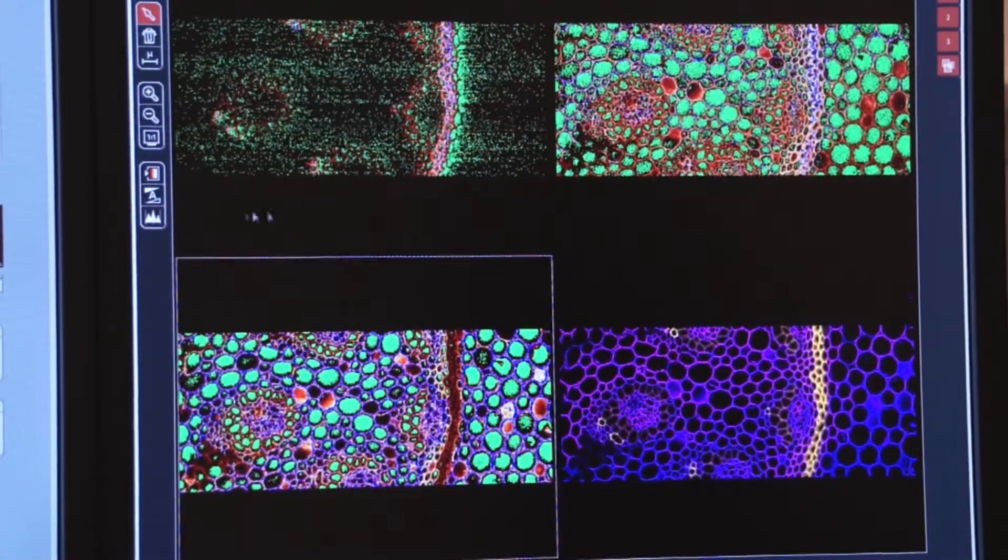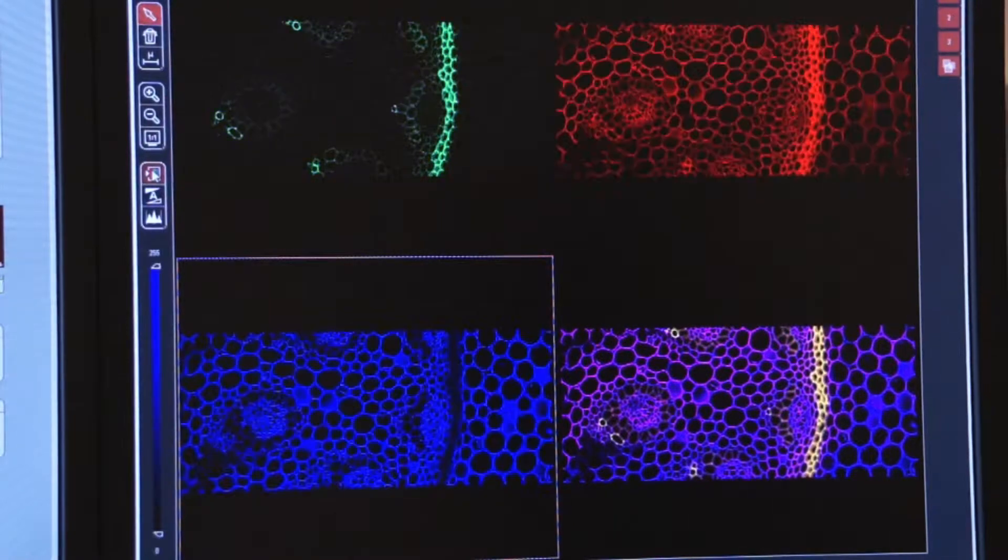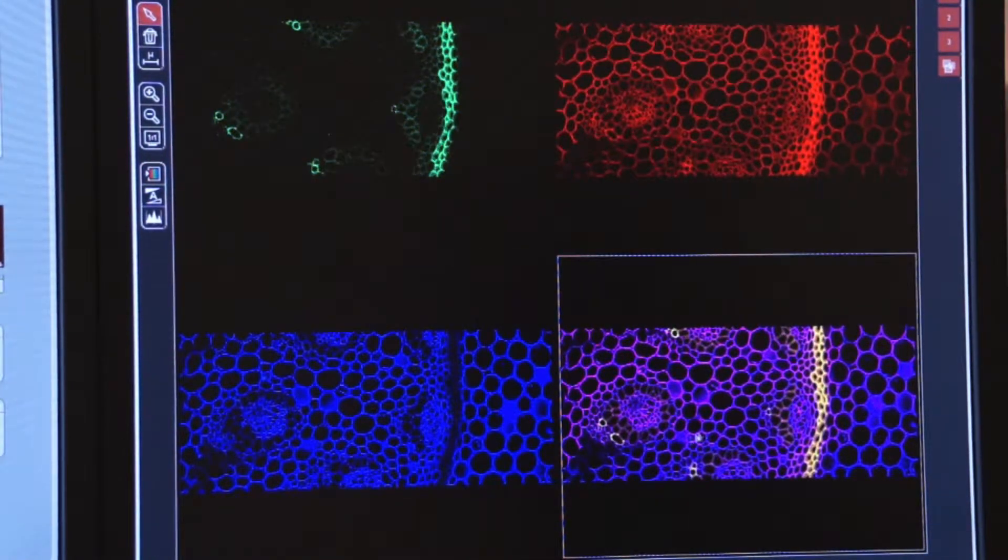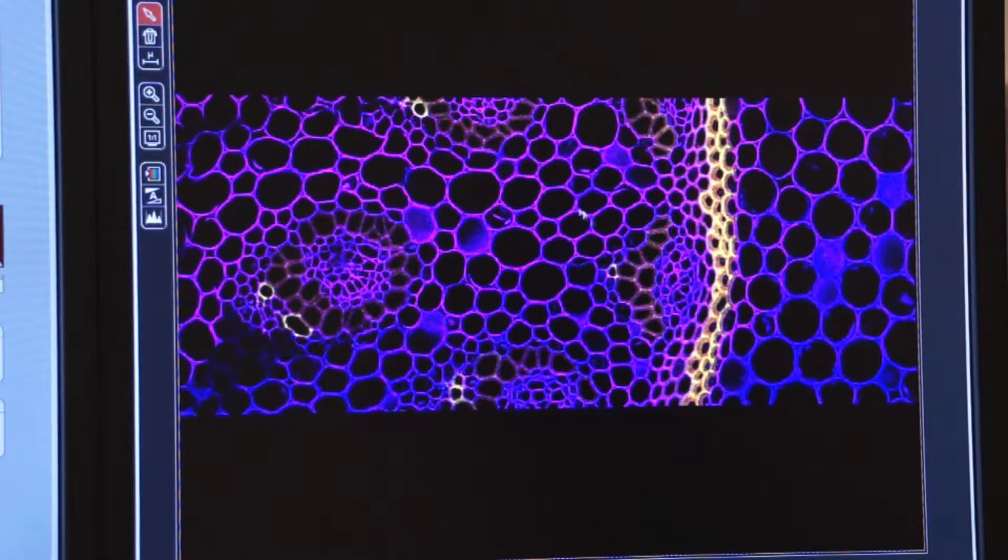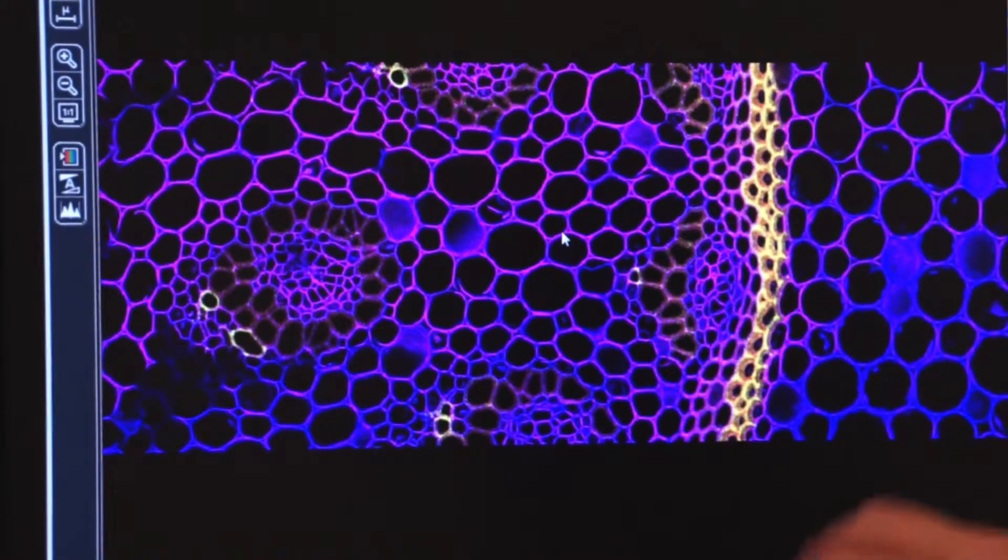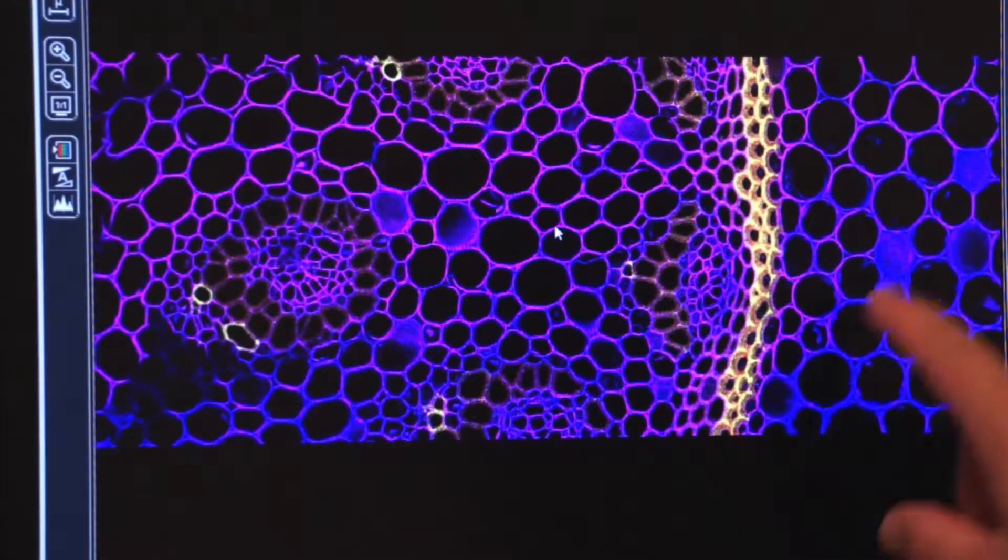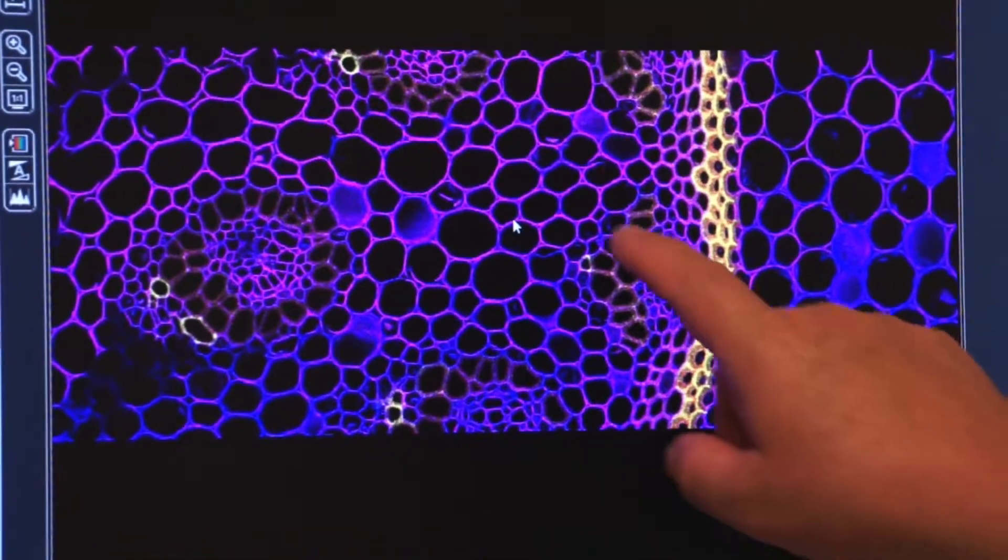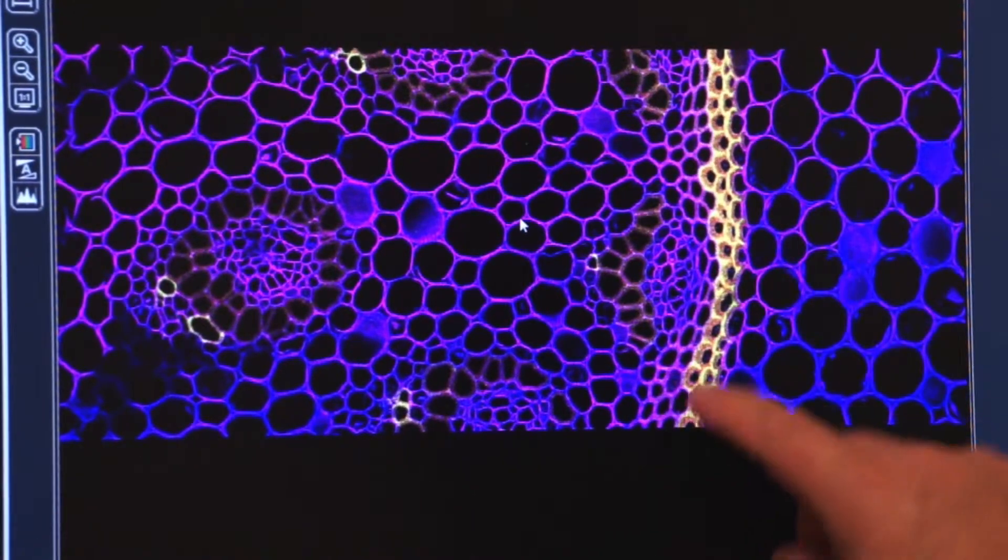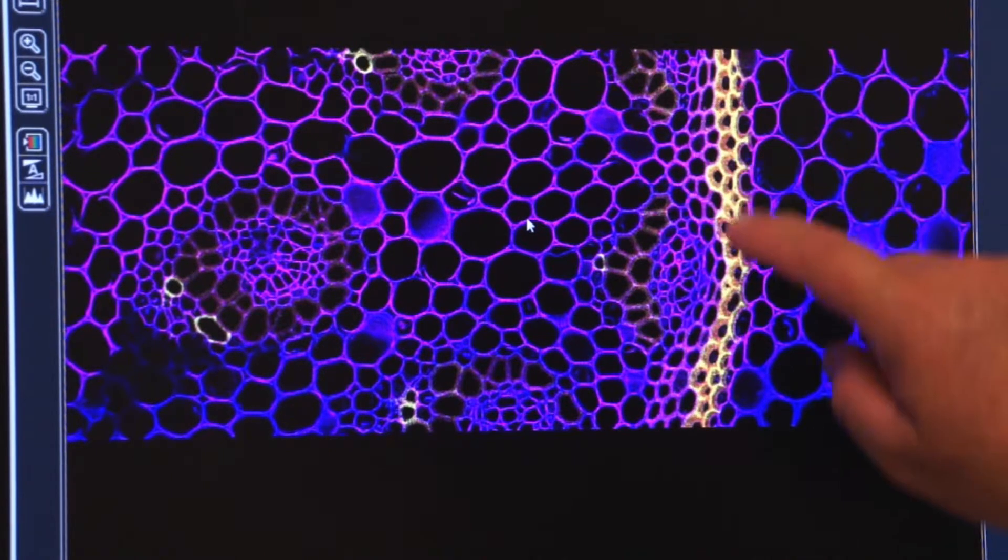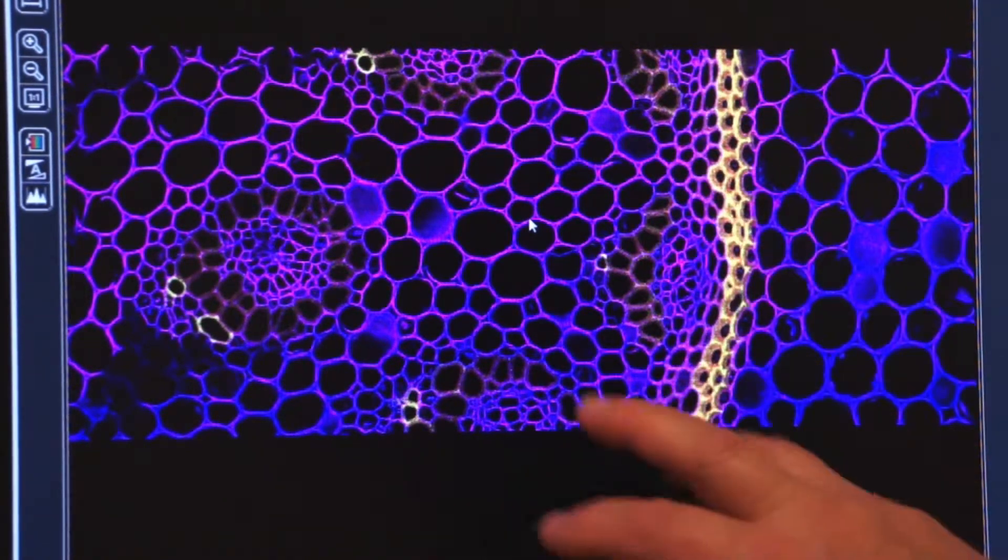And now we'll click through the lookup table. We see the composite image showing all of this information output into one different image. We have three distinct colors here: a blue color, a pink color, and then a golden color. Actually a fourth color, sort of a brownish color. So we're really getting a lot of information back by engaging all of these PMTs.